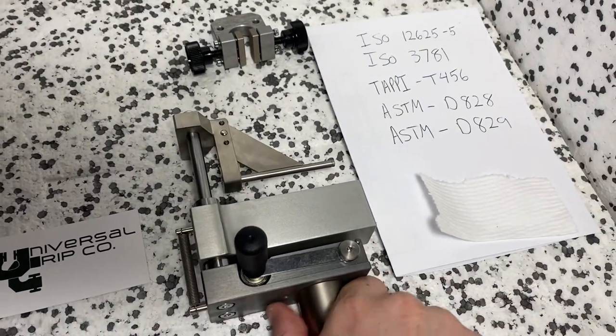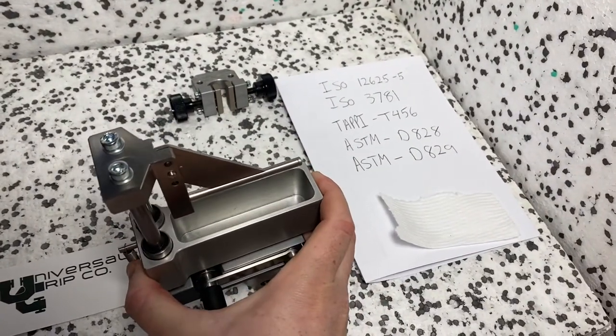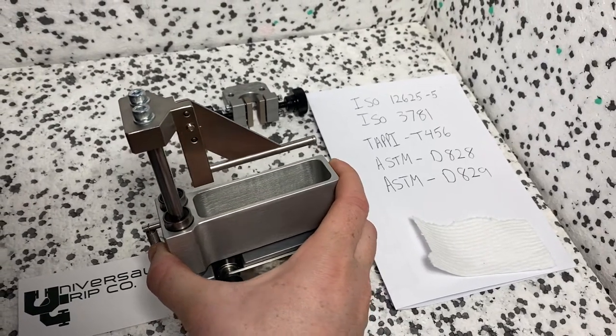This fixture is designed to hold the sample as well as moisten the sample before you go to tensile test it.